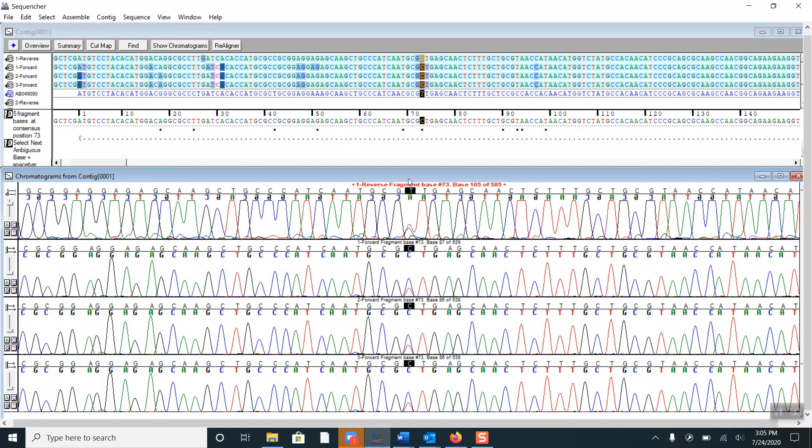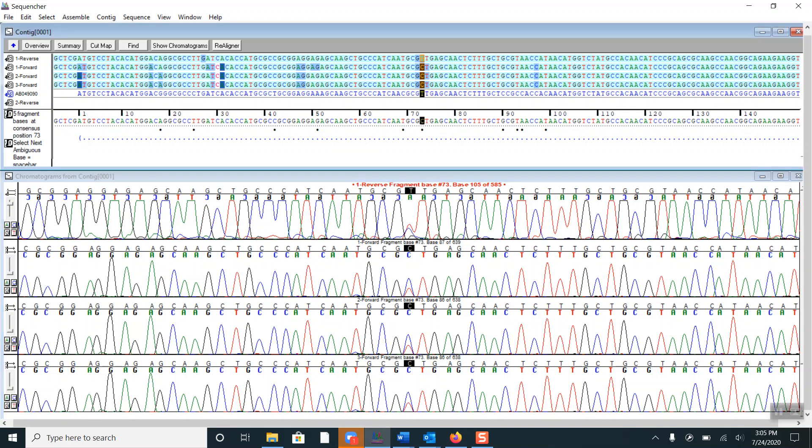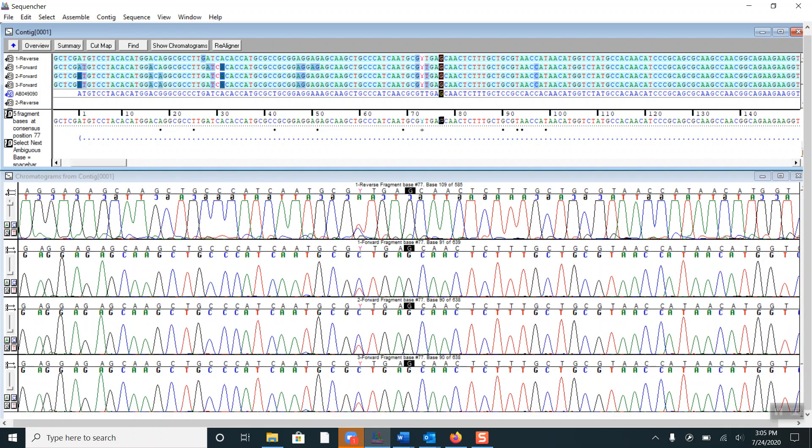So what we'll do is click on the consensus sequence and type Y, the ambiguity code for C or T, and this changes the base call in each of the fragments to Y. If I click to the side a little bit, you will note that the Ys are in magenta, which indicates that they have been edited in Sequencher.